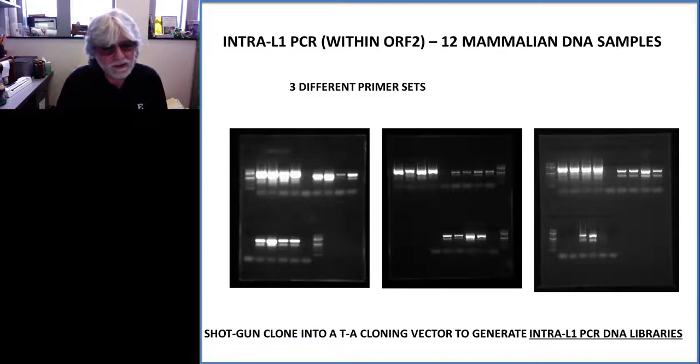Okay, and so continuing, what we did was shotgun clone them into a TA cloning vector and essentially generated these intra-L1 PCR libraries, because each band that you see is not a single locus. It represents thousands of different L1 elements found throughout the genome.